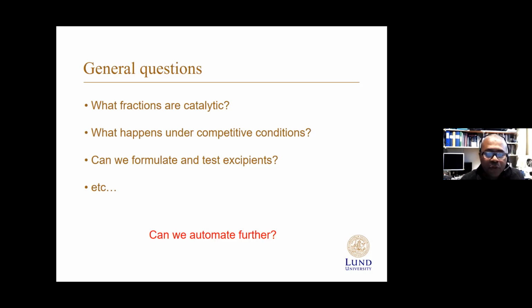But if we go further than that, we could also ask the question, can we use this particular approach to see how protein could be formulated, meaning testing some excipients? So I will have a chromatography where I have only my monomeric system, and then on the parallel channel, I will run some excipient to see how my molecule would behave if I add, let's say, a lot of sugar to protect it or any other excipients. And then the list could go on forever.